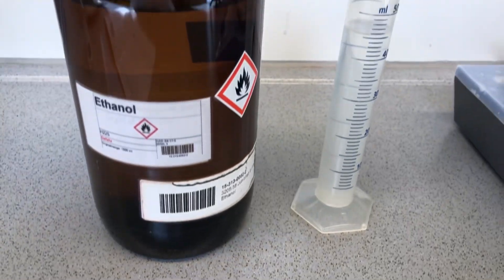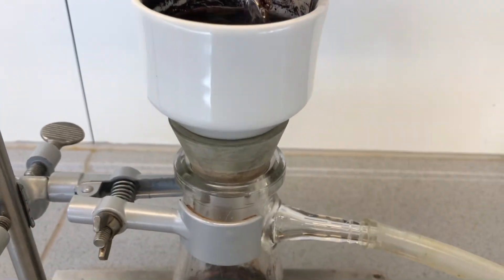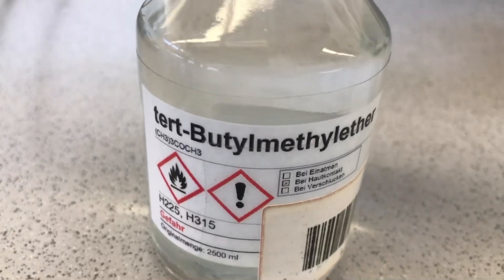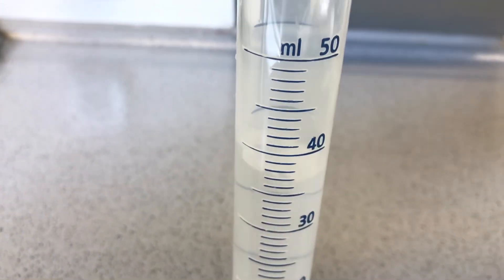For the second wash, 45 milliliters of ethanol were used. And for what I hoped would be the last wash, we used 45 milliliters of butyl methyl ether.